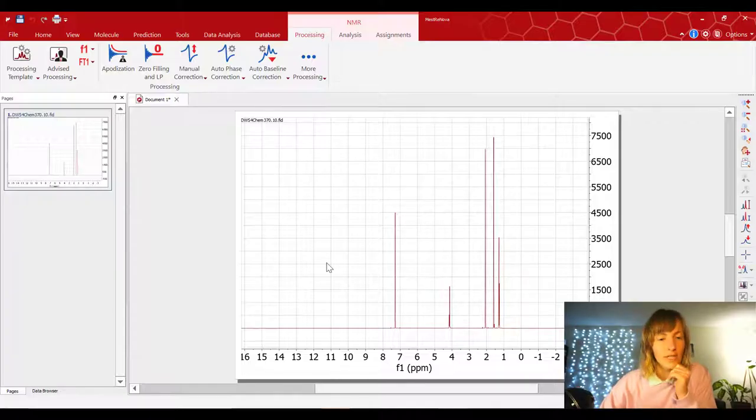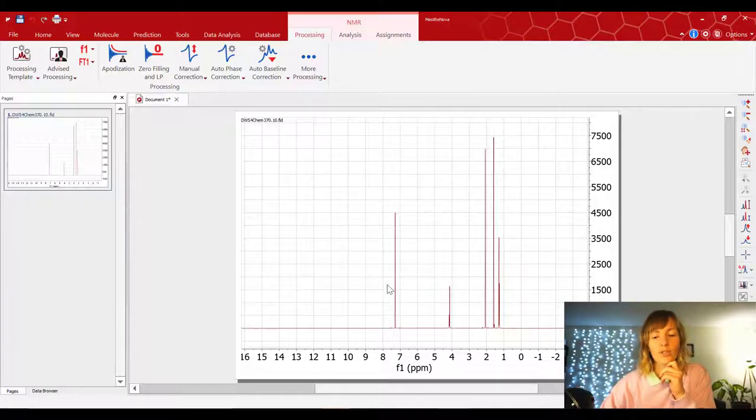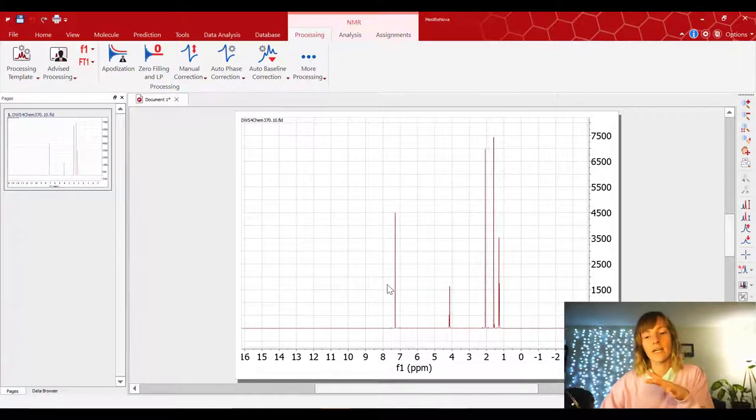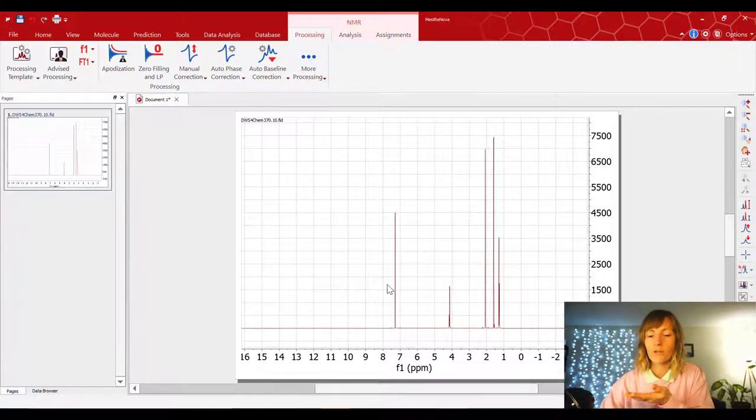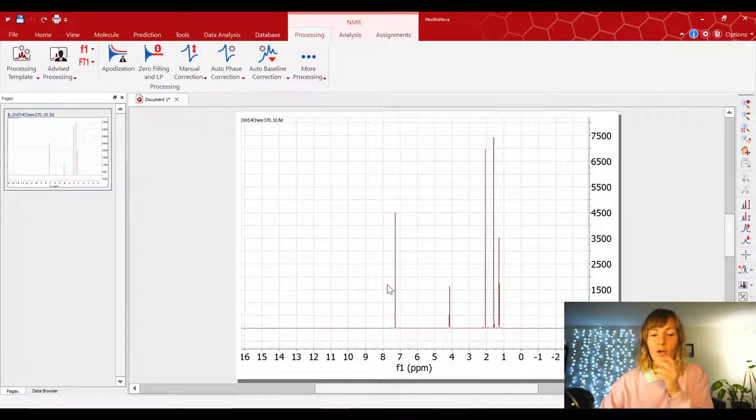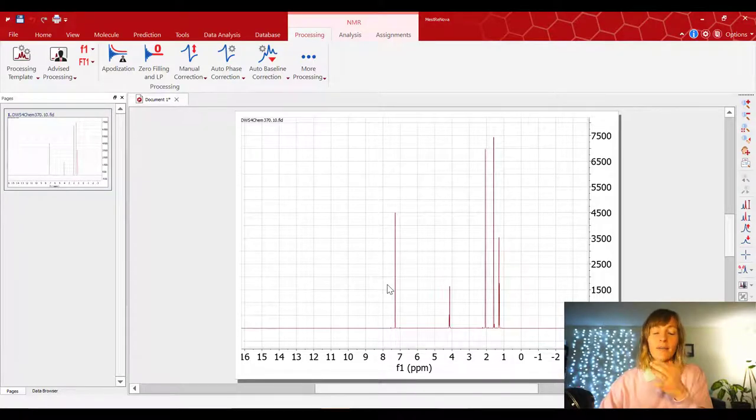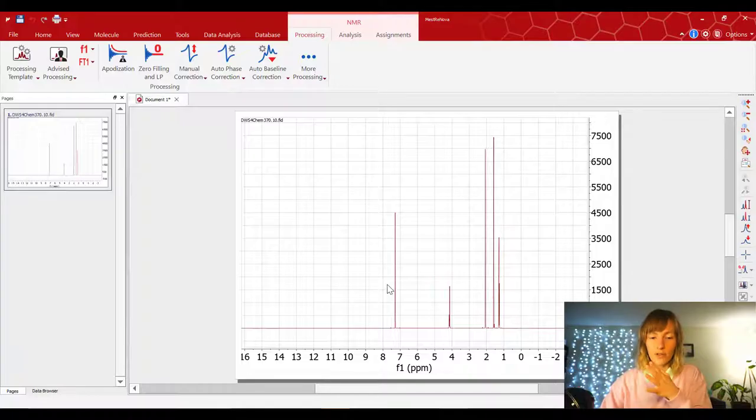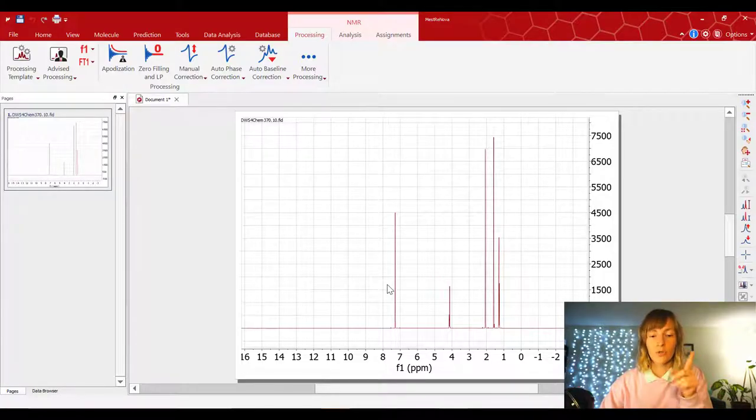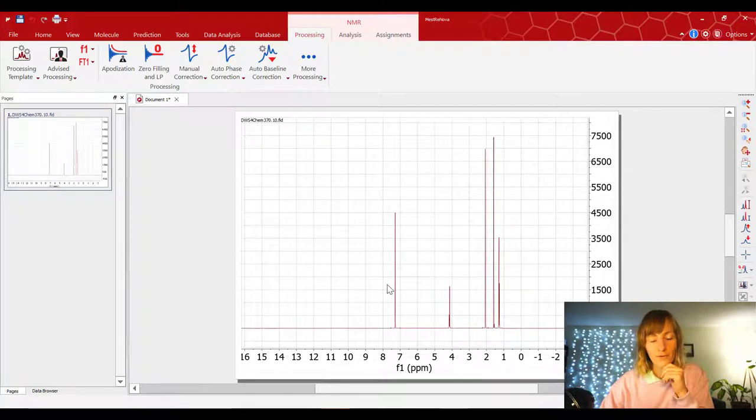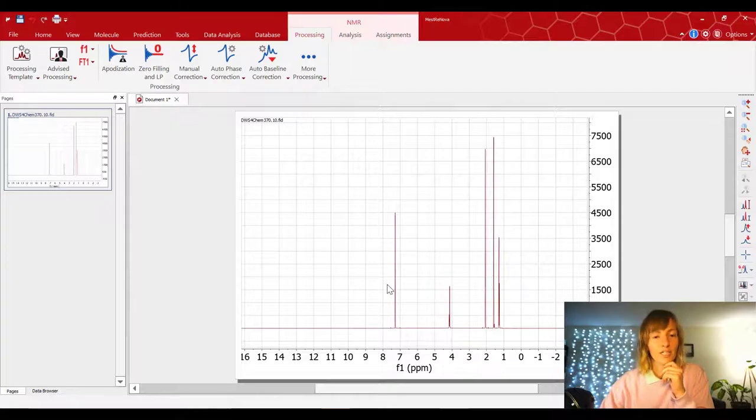Once you've done that, the next thing to do is to calibrate our spectrum. Remember I was saying oftentimes people will put this TMS molecule in there as a zero for calibration. We didn't put that in to our sample, but instead we have a little bit of proton containing chloroform, and we're gonna use that signal as our reference for the NMR spectrum.